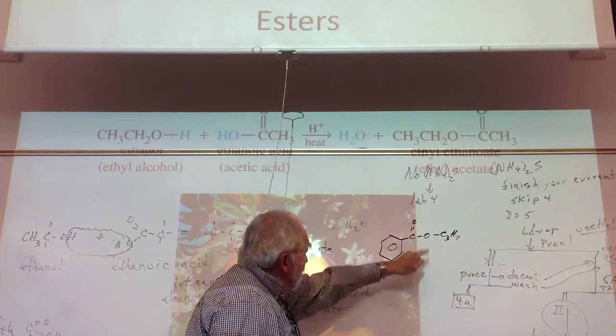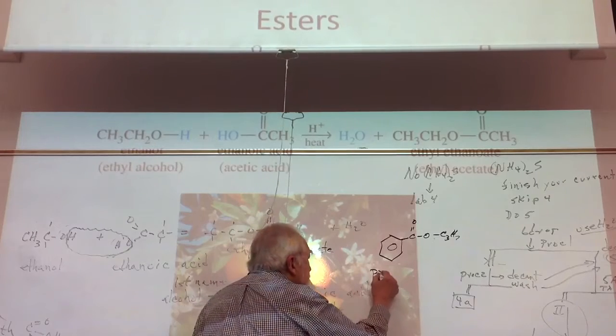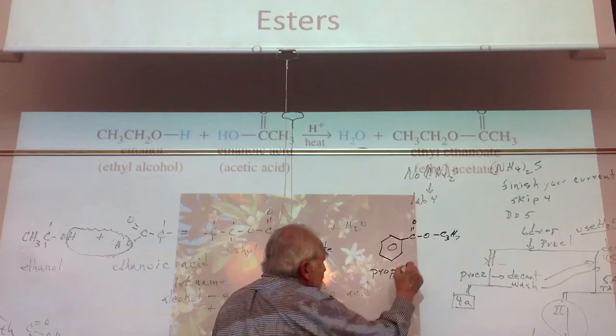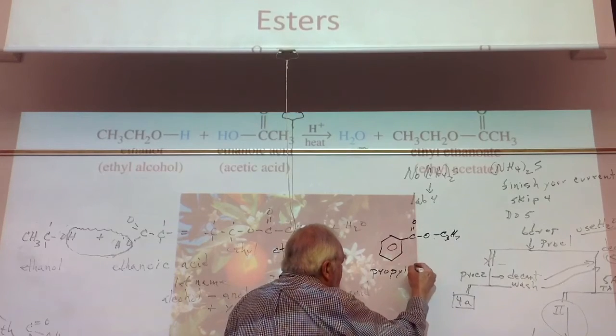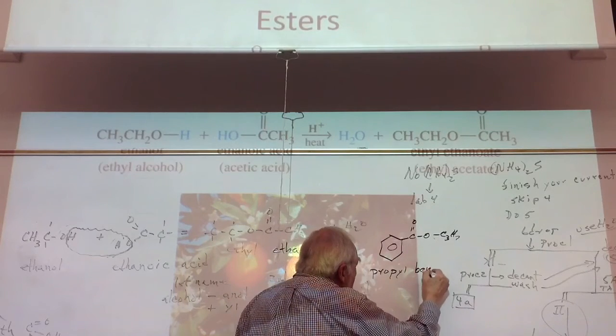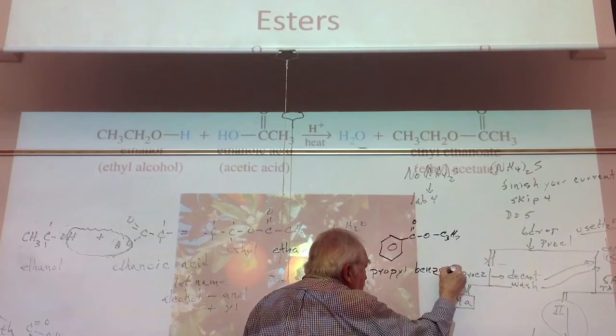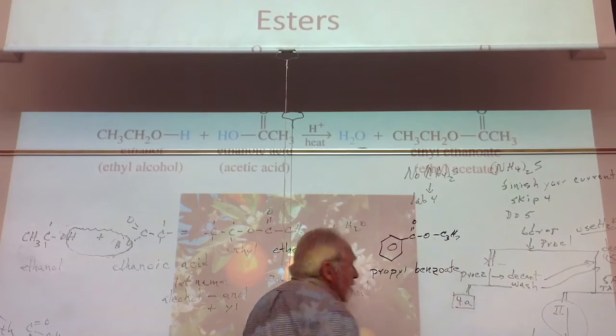This thing, so it's propyl. What did I just say for this one? Benzoic acid, so it's benzoate.